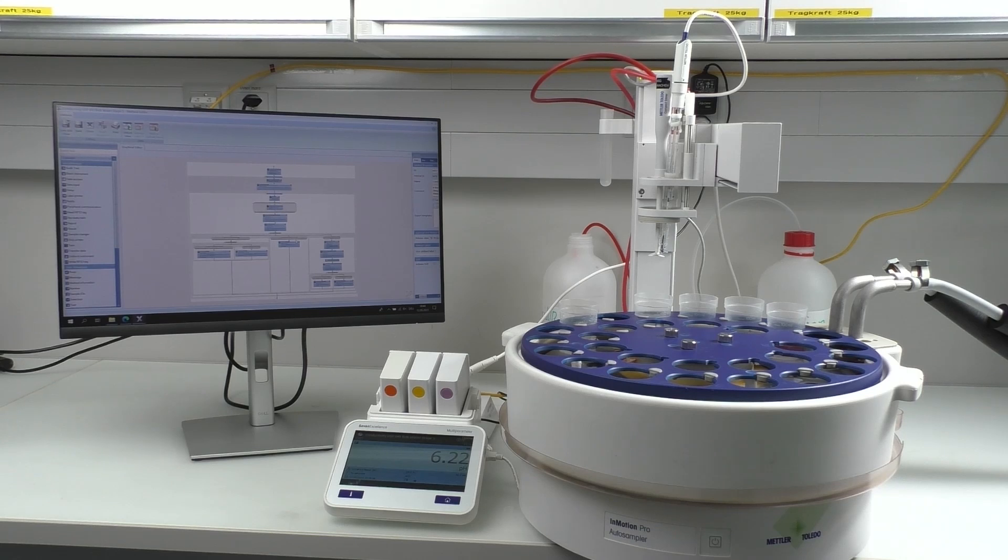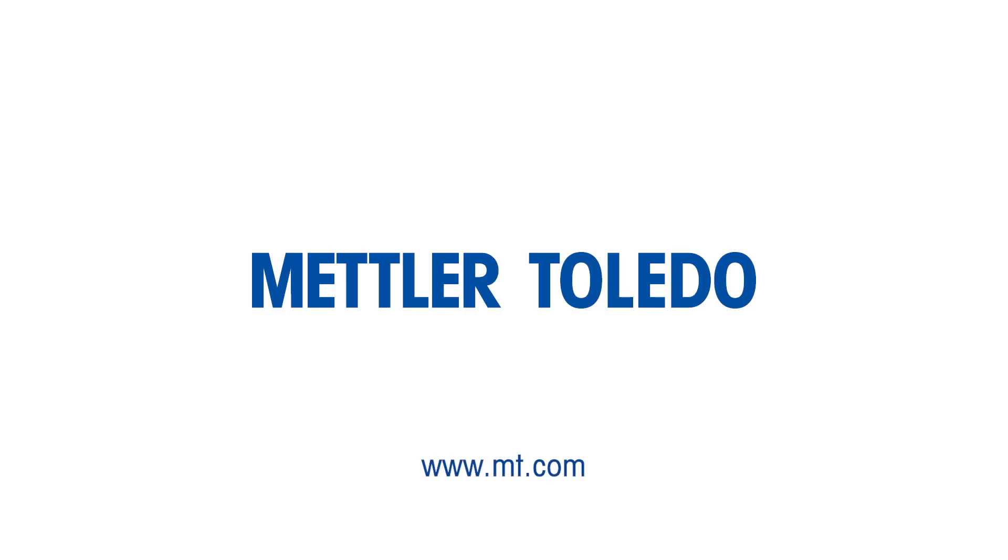With this, we have come to the end of conductivity measurement in automation mode. For more information check www.mt.com.